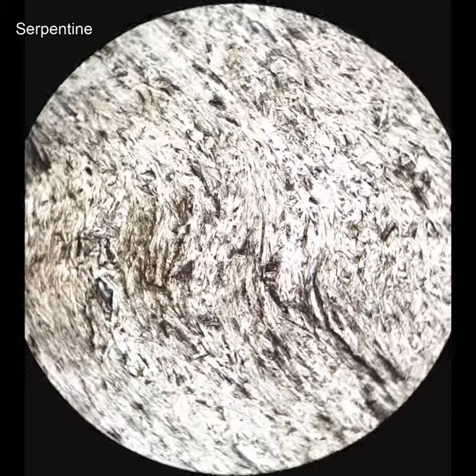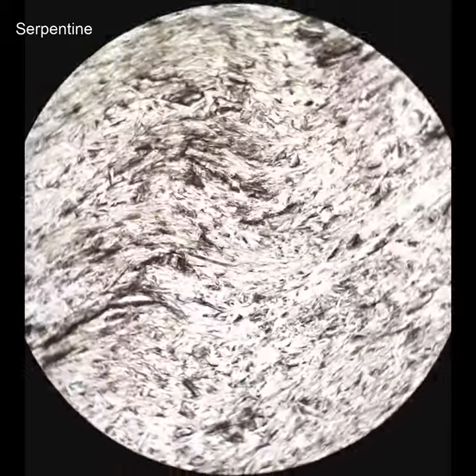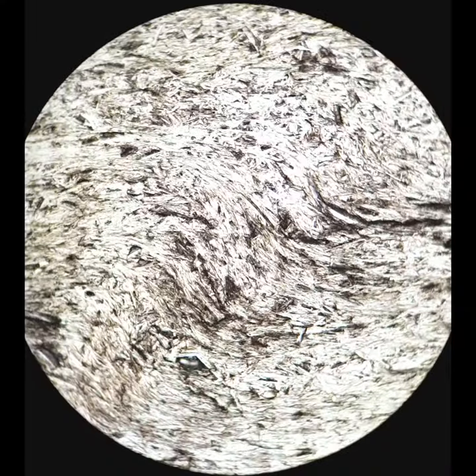More serpentine. This has a fold running across it, so when I get around to crossing the polars, you'll see this sweeping undulatory extinction. That's because the individual serpentine grains are in different orientations, so they go extinct at different angles as the stage is rotated.